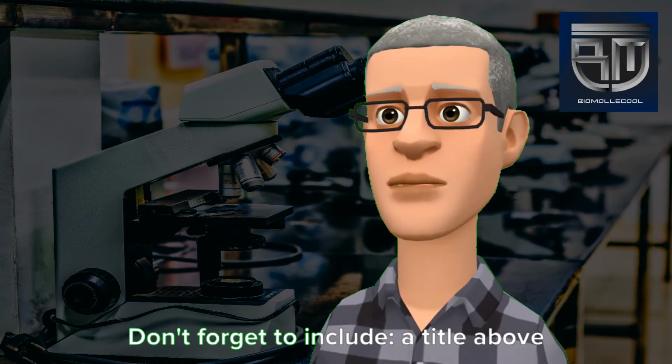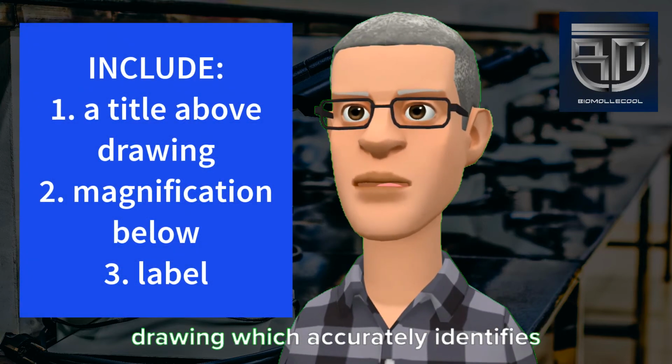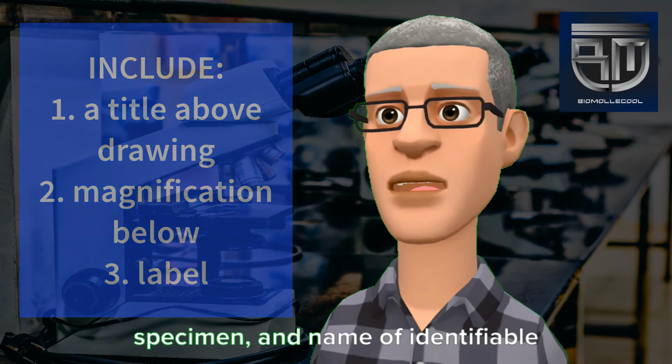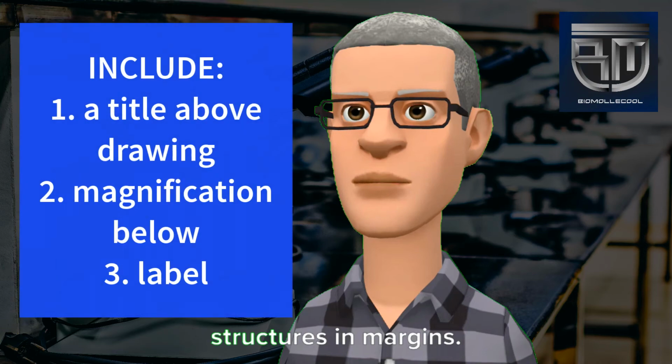Don't forget to include a title above the drawing which accurately identifies the specimen, magnification below the specimen, and name of identifiable structures in the margins.